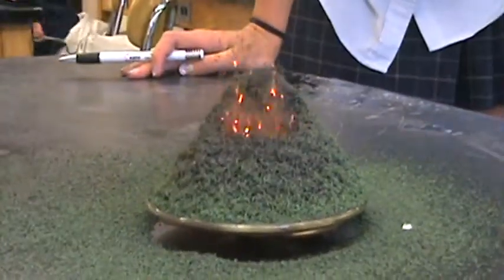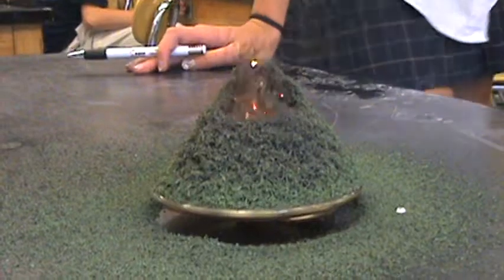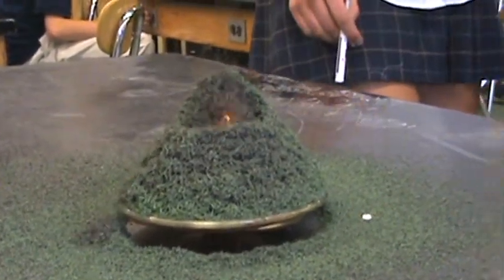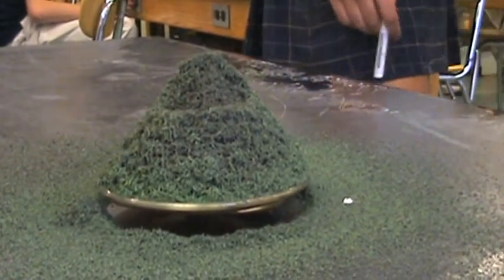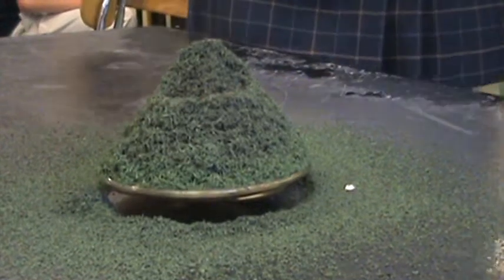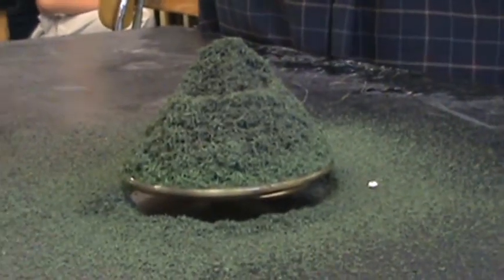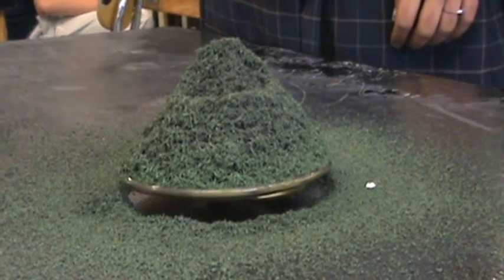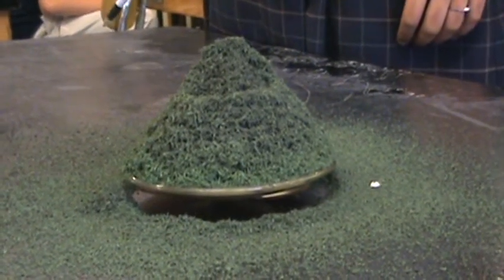Okay, so that's ammonium chromate. There we go, slowing down now. That was nice. Guys, what actually happened? I don't know. It's green. That was awesome. That was classic.